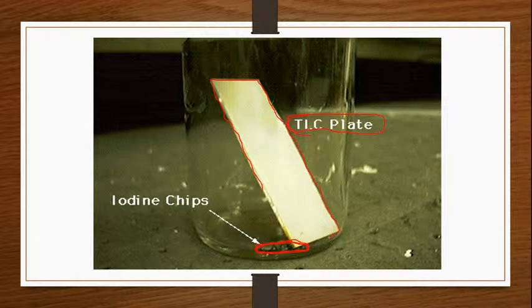So what I mean to say is, you just have to introduce your chromatogram, so-called TLC plate or paper chromatogram, inside this jar. Remember this jar, in which you already kept the iodine crystals. These iodine crystals after fumigation will produce fumes of iodine, and when they stick to your sample, it results in a yellowish color, which can be easily detected and marked by the examiner.